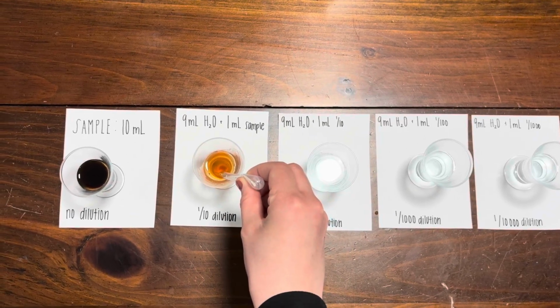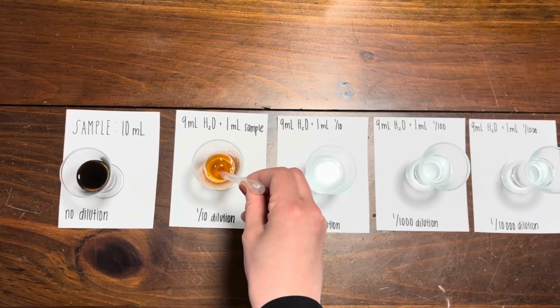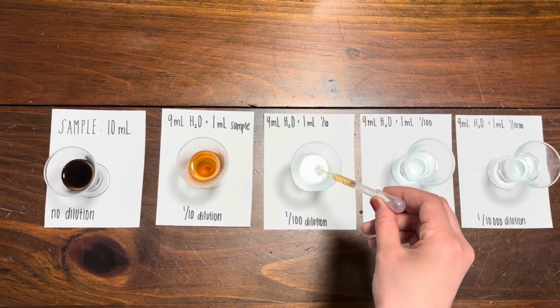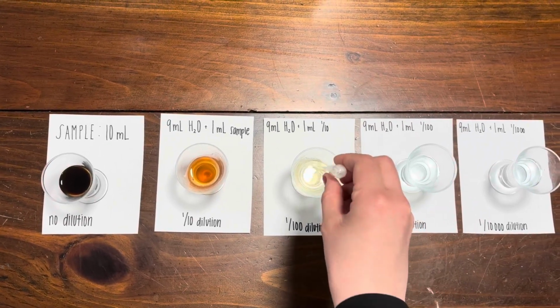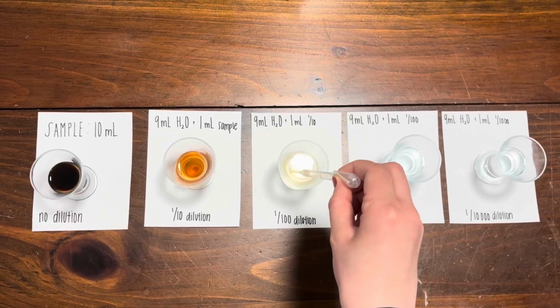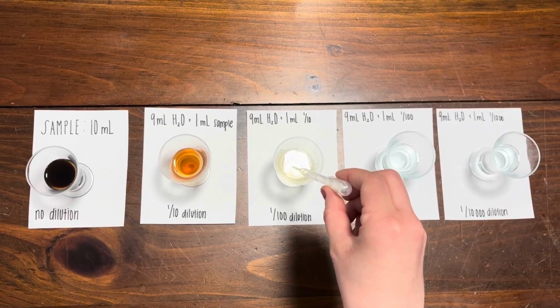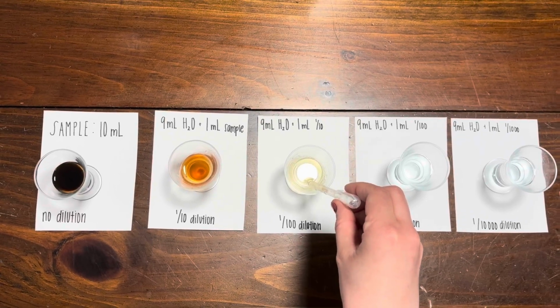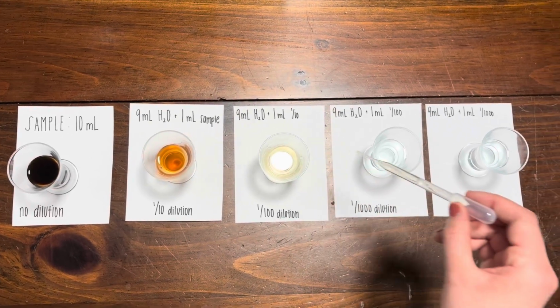I will take 1 milliliter from here, transfer it to the next, and mix it. This represents a 1/100th dilution. The next one, 1 milliliter to here.